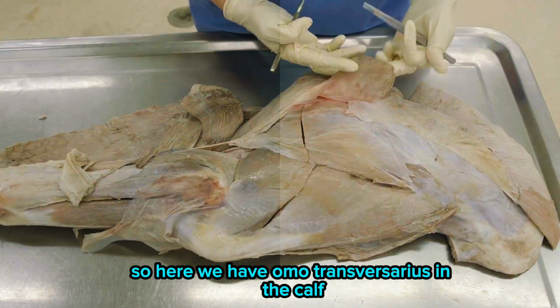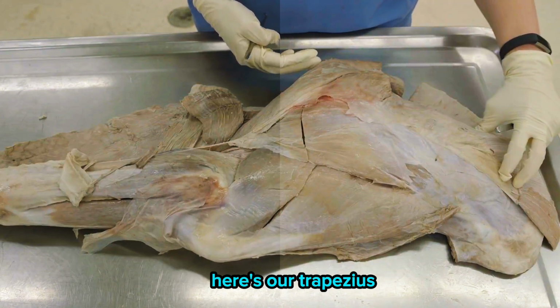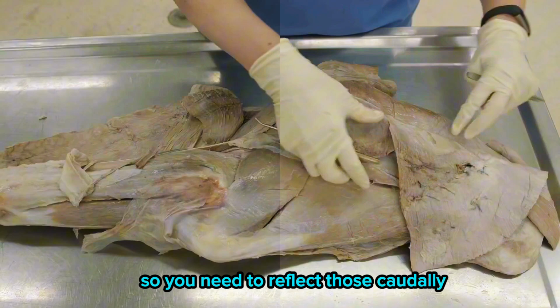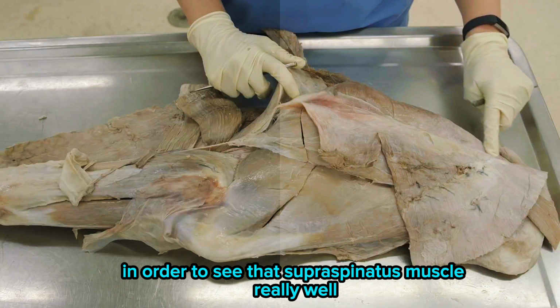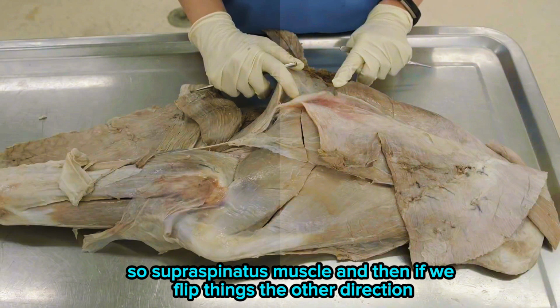detached limb. So here we have omotransversaris in the calf. Here's that brachiocephalicus muscle. Here's our trapezius. So all of those are kind of stumps that are just hanging out there. So you need to reflect those caudally in order to see that supraspinatus muscle really well. So supra means above, so above the spine on the scapula, so supraspinatus muscle.